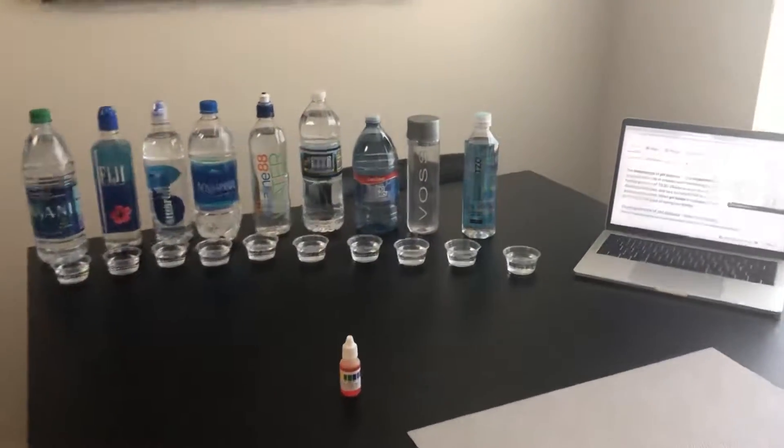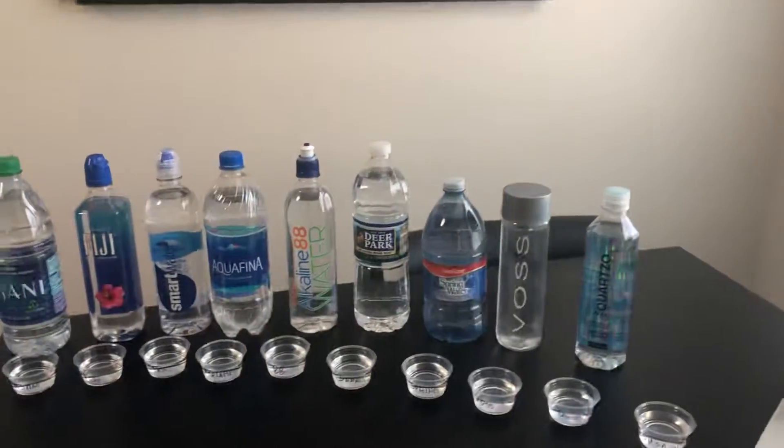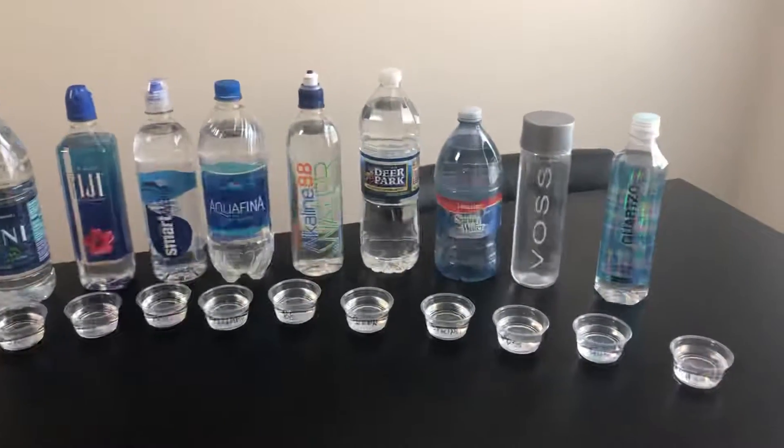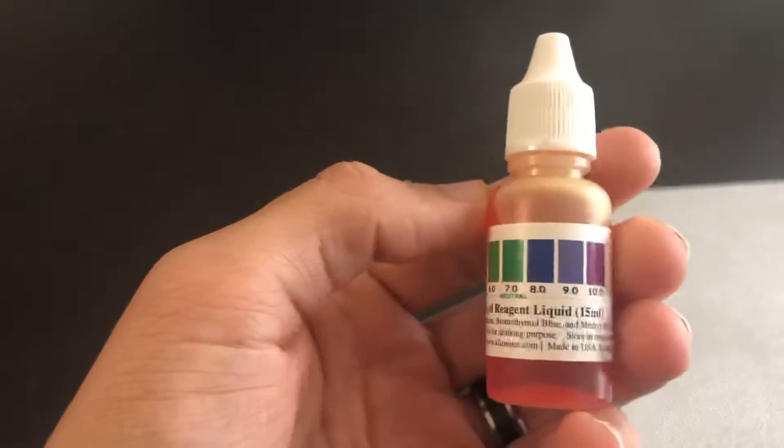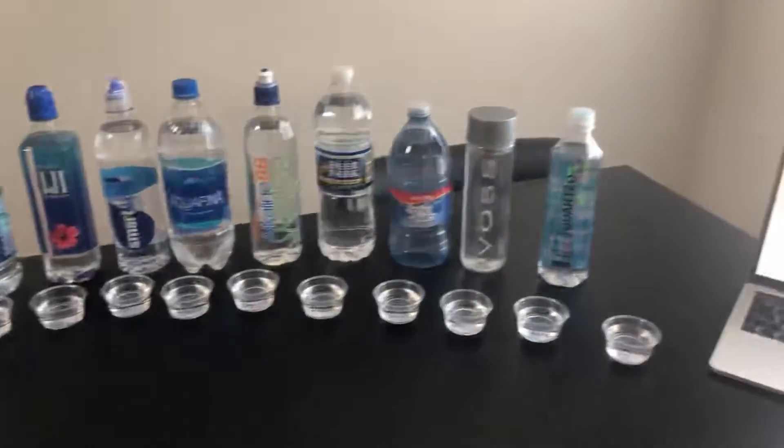Today we will be checking the pH water levels of all these different types of water. We will be using this pH water tester that I got off Amazon. You may ask: why is pH level important?